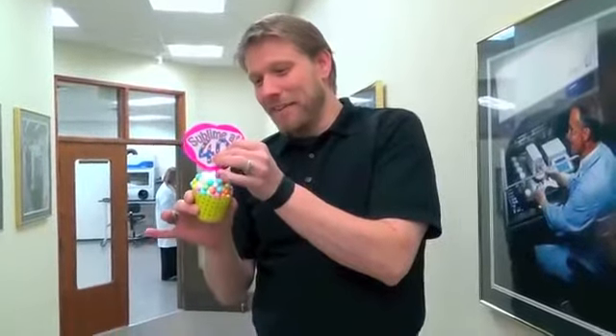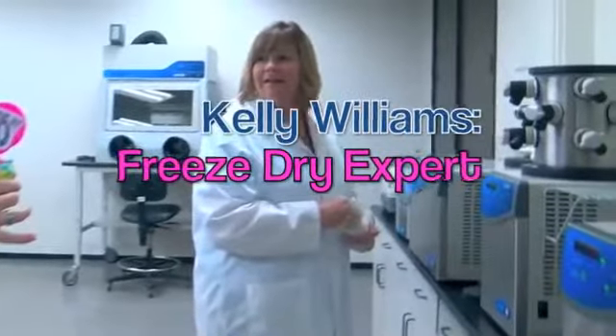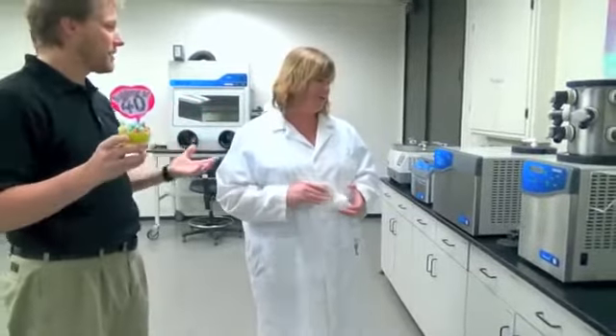Hey, how's it going! The Labconco freeze-dryer is turning 40 and I want you to come with me because we're going to give it a cupcake and celebrate its 40th birthday. So guess who's 40? The Labconco freeze-dryer! You're kidding, right? Yeah! So what I was wondering is if you could help me give it a cupcake for its 40th birthday — we'll just lyophilize one.